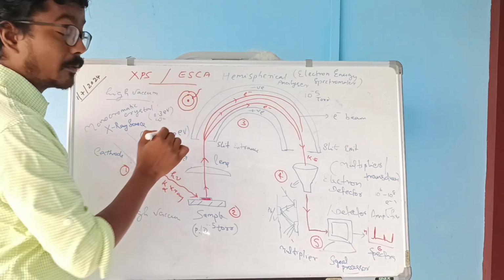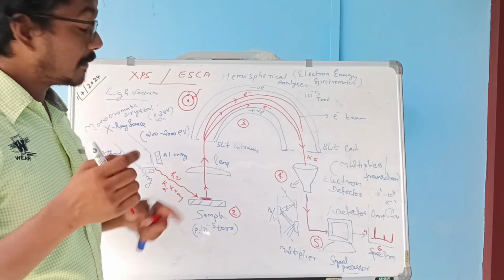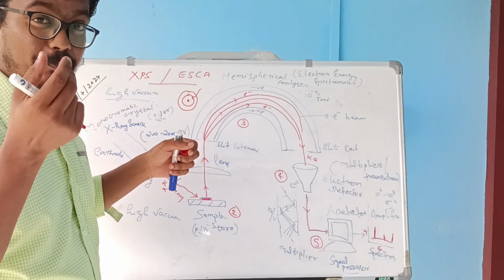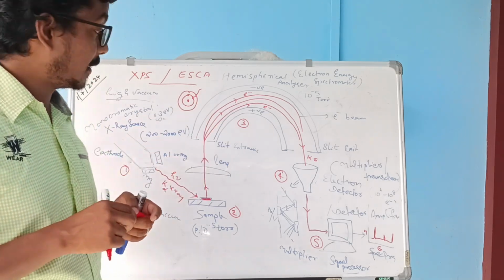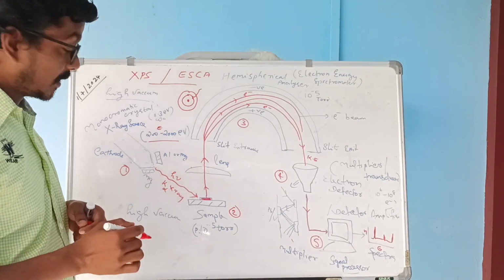The X-ray beam is hitting the core electron, so we need ionization energy there, unlike the valence electron. We can control the energy of the X-ray by hitting the valence electron instead, as in ultraviolet spectroscopy. So this is the energy of the X-ray.